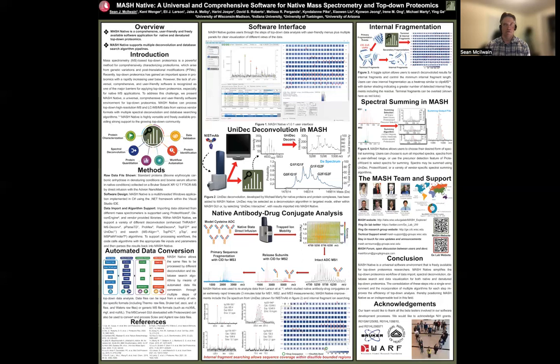When searching internal fragments, the sequence coverage dramatically improves, and fragment ions generated from within disulfide bonded regions are revealed in the light chain with one bound drug, which is LC1. This enabled broader sequence coverage and localization of disulfide bonds within LC1.